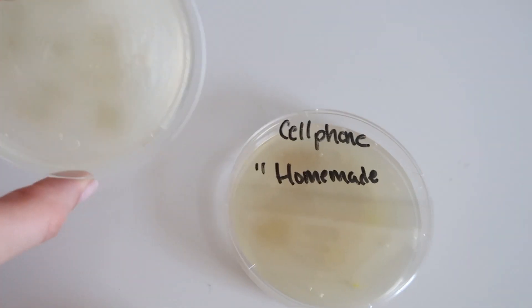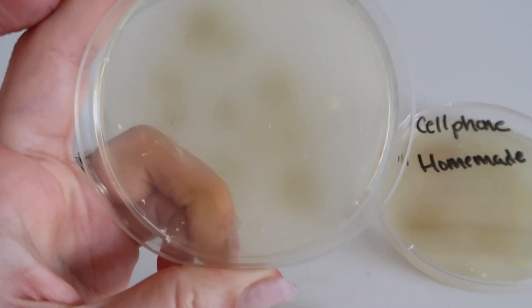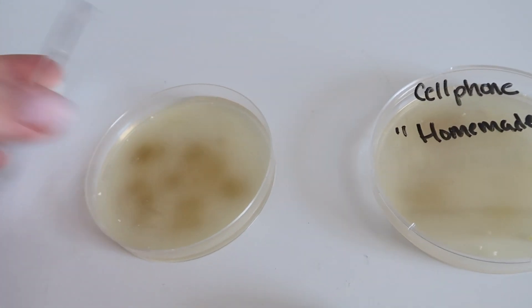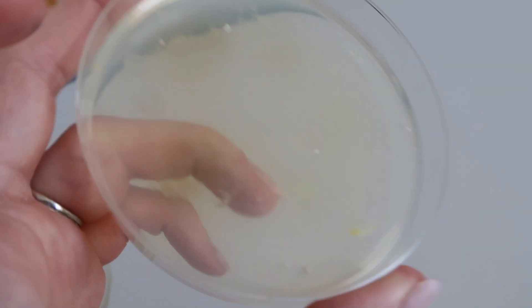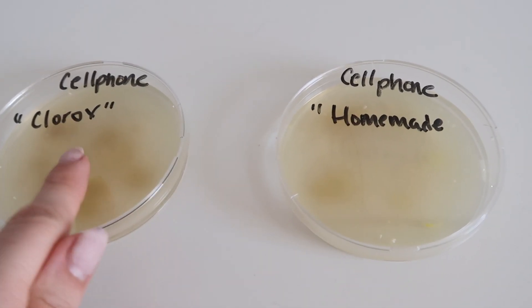Let's look at the Clorox one for the cell phone — there's still a little bit of residual growth left but for the most part it's pretty clean. The little white specks that formed are additional bacteria still growing. The homemade one actually has just a bit more growth than the Clorox one, and some of it is new growth since I last cleaned it. It looks like the Clorox did better for the cell phone.